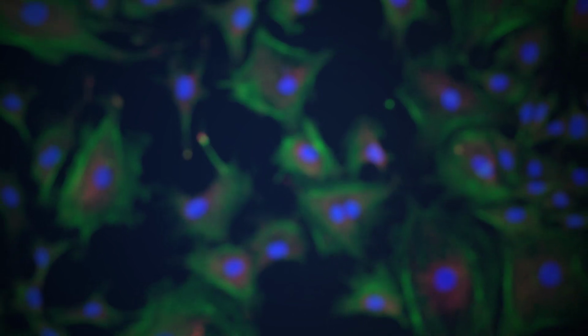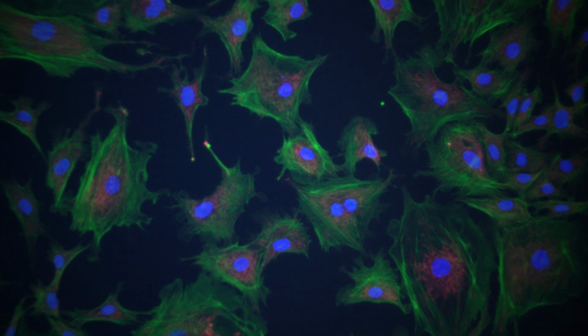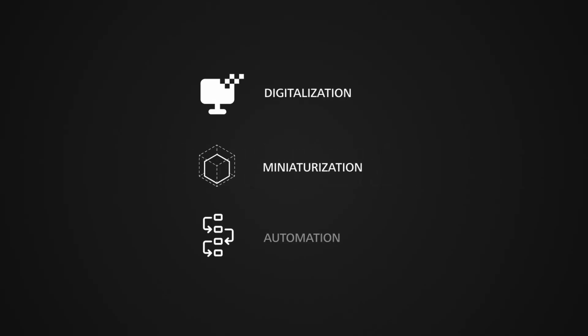Making the unknown visible is the key for success in life sciences. Microscopes have propelled research findings in life sciences and diagnostics for several centuries. Influence the success of your next generation device with digitalization, miniaturization, and automation.